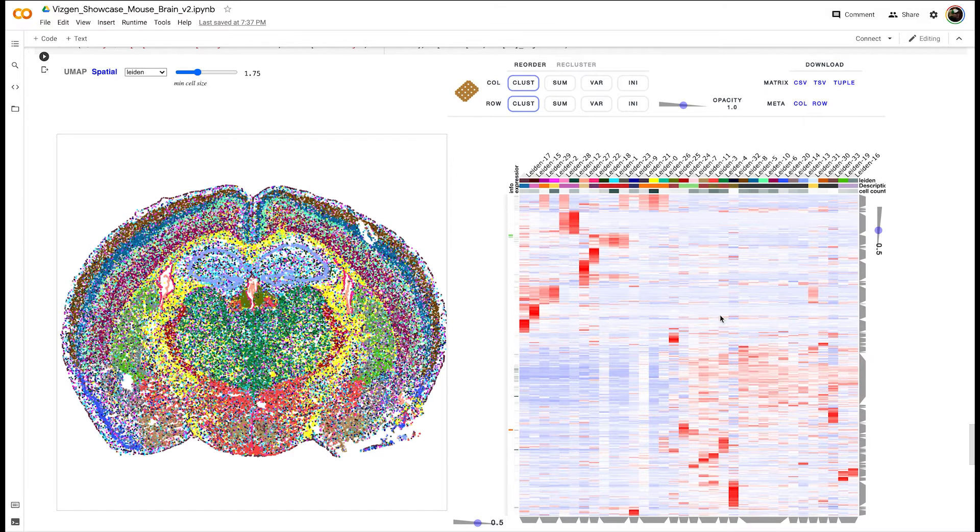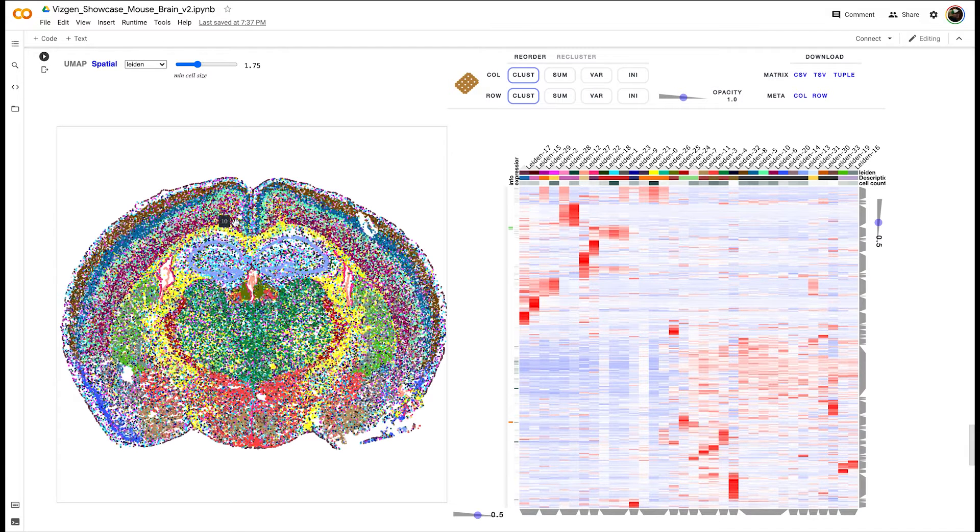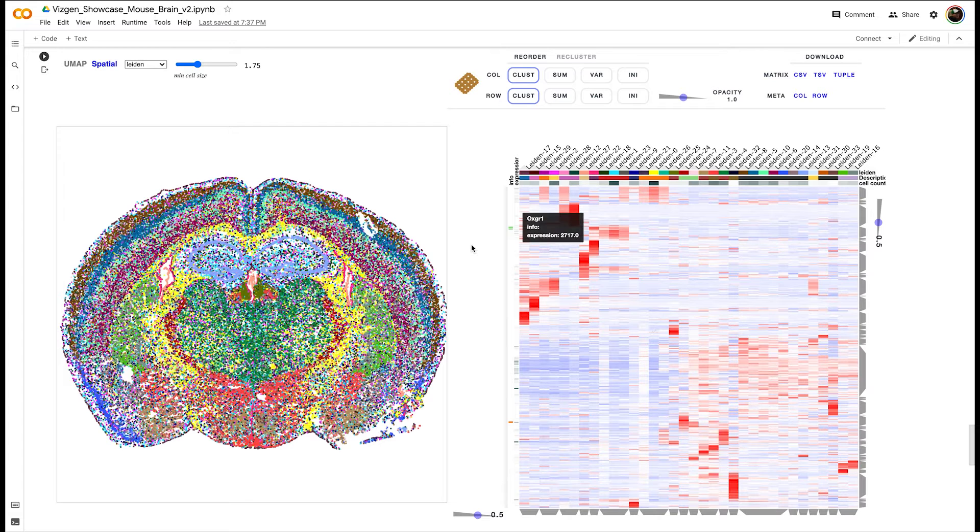This view allows us to see spatial data on our left and high-dimensional gene expression data on our right, and we'll demonstrate how these views can complement each other.